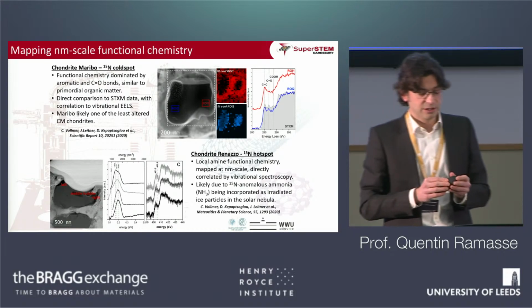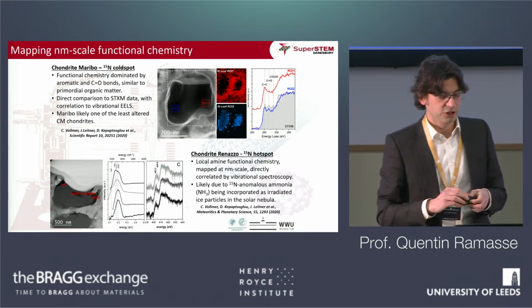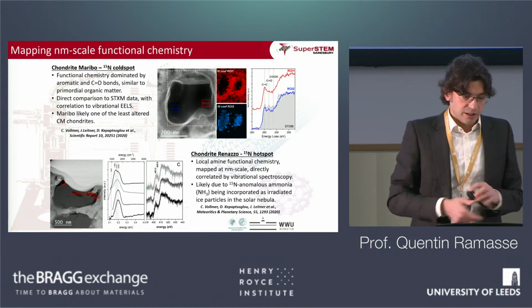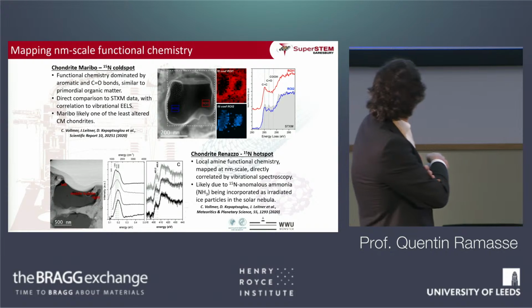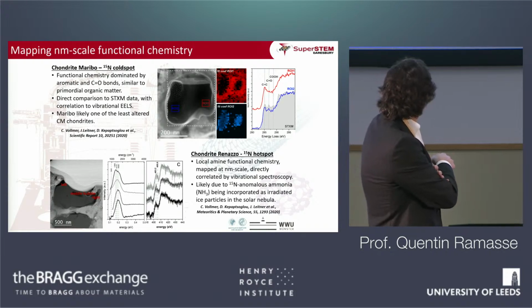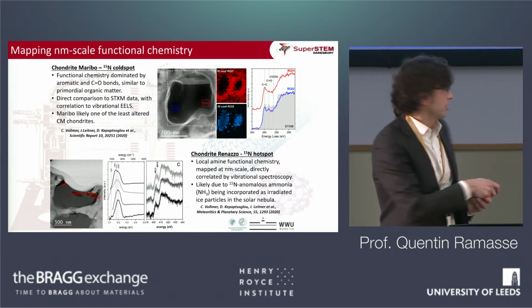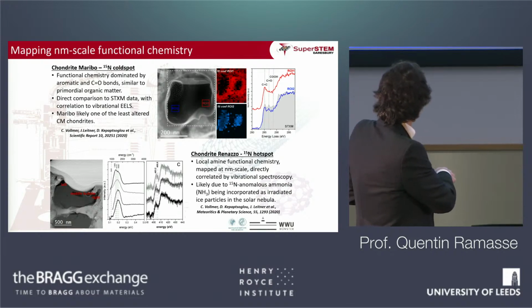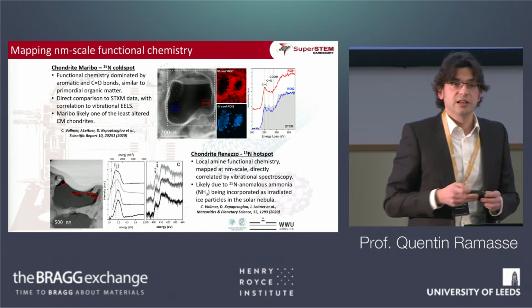And as a very initial pointer to what we'll be talking about later, you'll notice on the bottom side here, another graph that is at a much lower energy range. This time, instead of looking at hundreds of electron volts of energy loss, we're looking at hundreds of milli-electron volts energy loss.